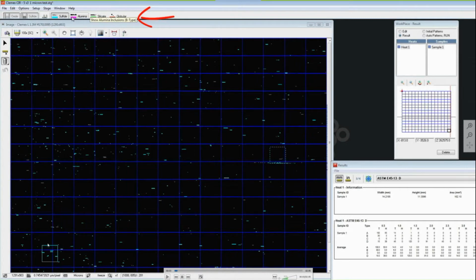You can notice here that this floating window is over 4 fields of view of the camera. So this is the big advantage with CIR, is that we're not limited to the field of view of the camera, but we create a map and we can reconnect the inclusions and find any heavy inclusion no matter where they are.